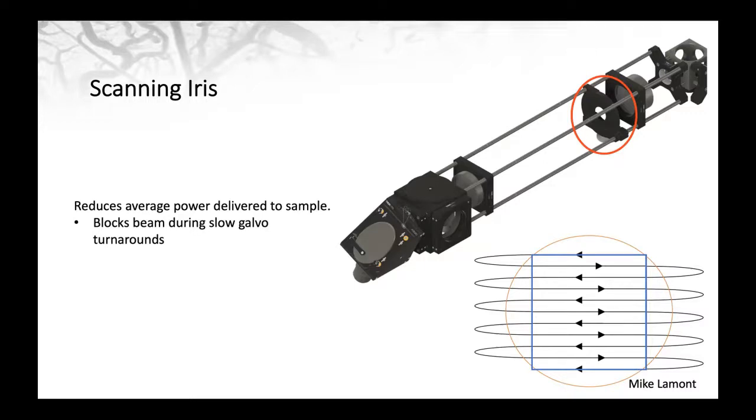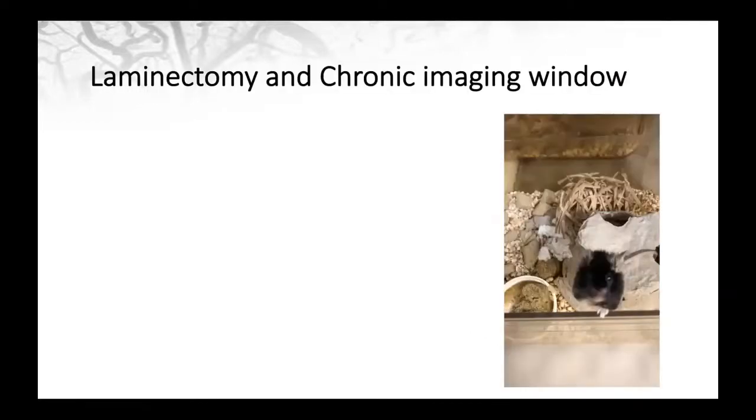Because what will happen if we're trying to image and we see an increase of the GCaMP signal, it could be looked at as activity, but it could actually be burning. So there are a few times where we were fooled into thinking that, wow, we see activity at this depth when it's actually burning.